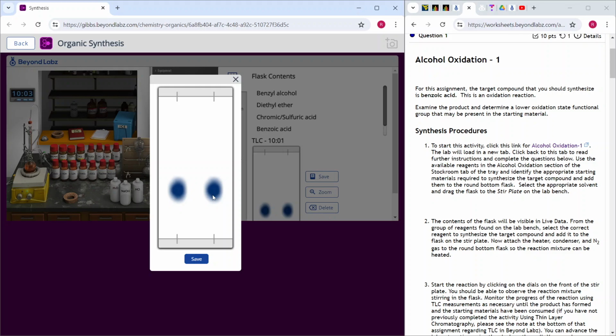And this is why we say we monitor the reaction with a TLC, because the TLC will tell me exactly when the reaction is going to stop. When this spot over here, I don't see it anymore, I see it in a different position, then this means that I reacted all my reactants. I have no reactants, I only have the products.